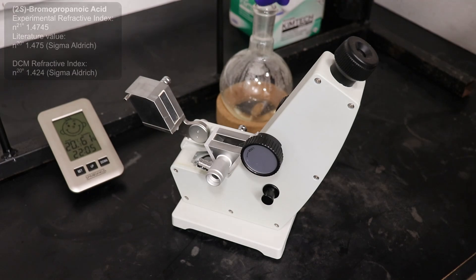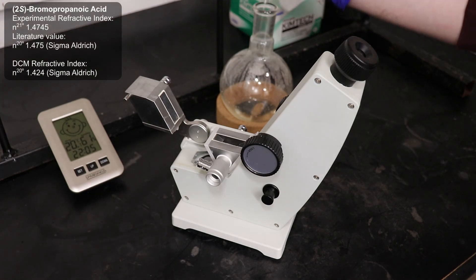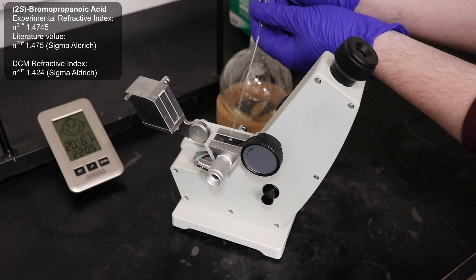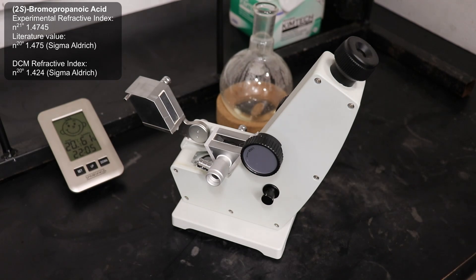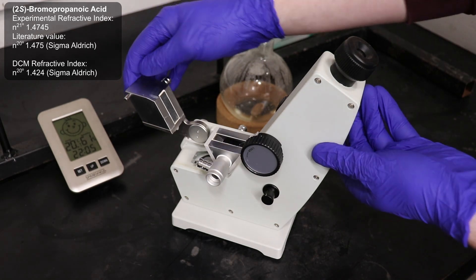I measured its refractive index, finding it to be 1.4745 at 21 degrees Celsius. This closely aligns with the literature refractive index value of 1.475 at 20 degrees Celsius, thus showing that I have actually made 2-bromopropanoic acid.